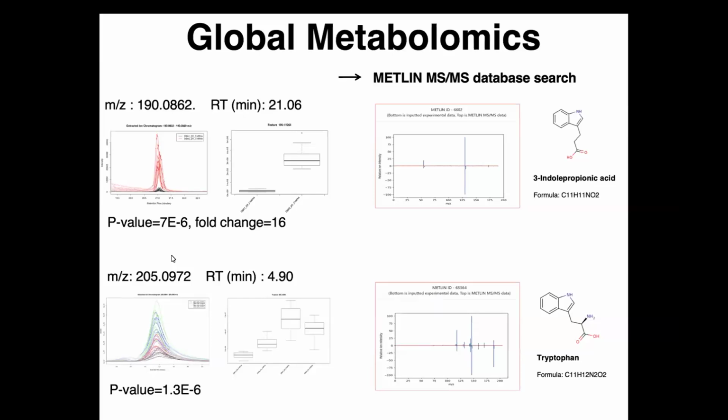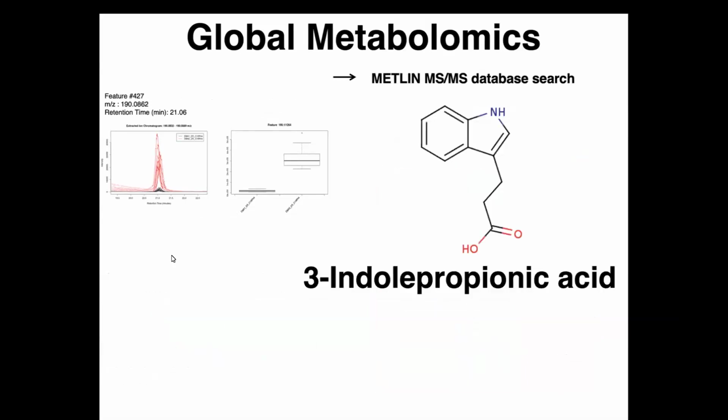Yeah, so what Lynn just described sounds like a fairly simple experiment, and it is. It's relatively straightforward, and of course, there are many other molecules that she observed in these experiments. But she focused on these two molecules. Tryptophan is one of the precursors to generating indole propionic acid. And indole propionic acid is a really interesting molecule. I could almost say it's one of the more interesting molecules we've identified in my 34 years at Scripps, almost 35 years now.